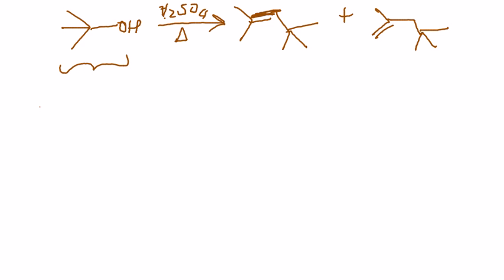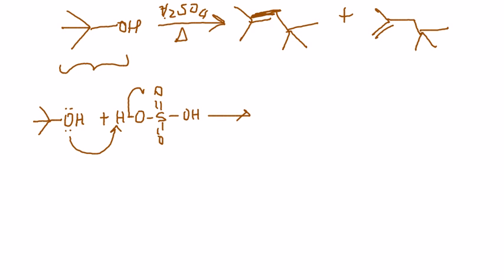So what we had done was we took T-butanol, and you treat it with an acid, a proton source. So hopefully you can see that this is going to cause protonation, loss of the bisulfate, so you end up with a protonated alcohol and the corresponding conjugate base leaves.